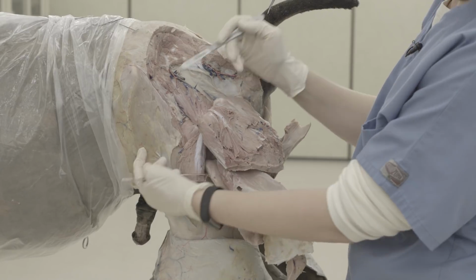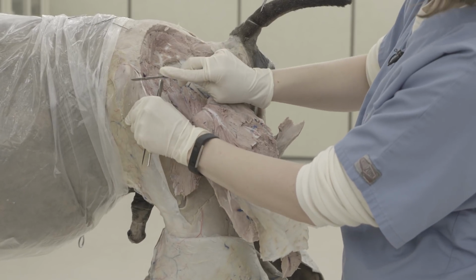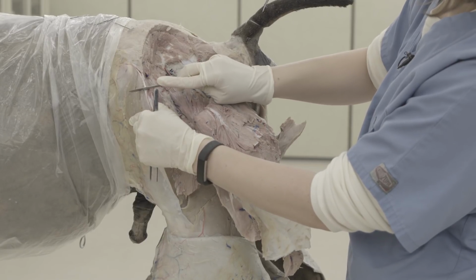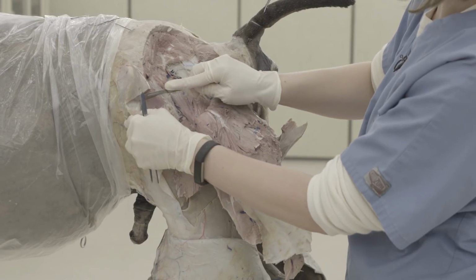You're also going to have to cut through your tensor fasciae latae muscle. So you can go ahead and just cut through and leave a stump that will stay with the body, and then the rest of it will go with the limb.